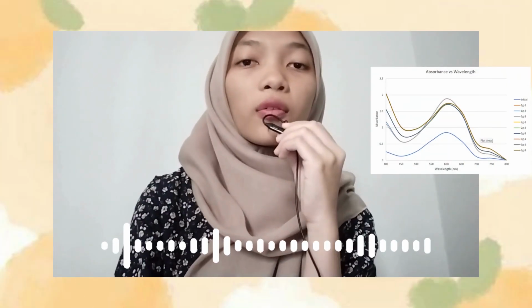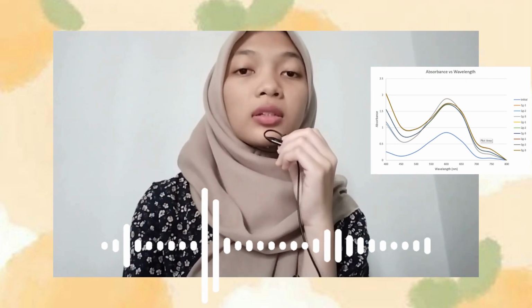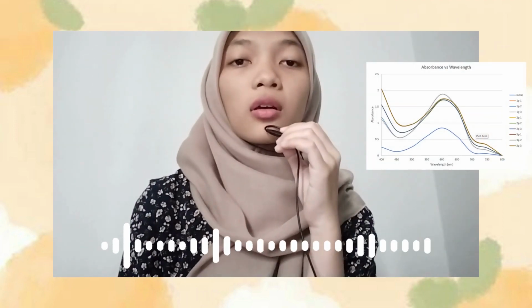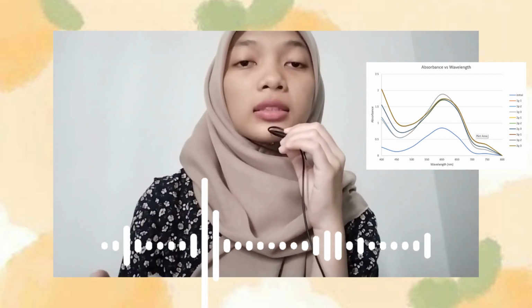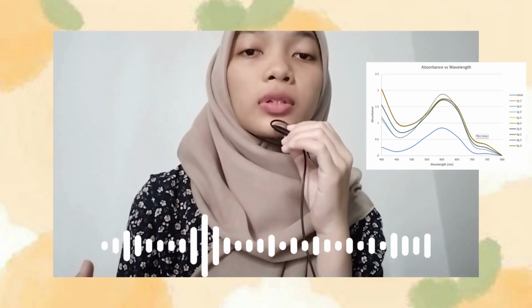We have three graphs, which are for sample 1, sample 2 and sample 3. Each of them has a peak at 600 nanometer. To compare all of the graphs with the initial graph, we need to combine them in one graph. For your information, all of the samples were rerun 3 times. So, in that graph, we have 10 lines, which is 1 line for initial, 3 lines for sample 1, 3 lines for sample 2 and 3 lines for sample 3.